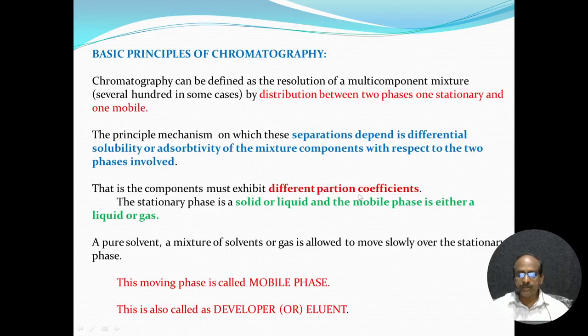That is the keyword to mention in the basic principle of chromatography: the different partition coefficients. The stationary phase may be solid or liquid, and the mobile phase is either liquid or gas. Please remember that the stationary phase may be liquid or solid, whatever it may be, and the mobile phase is either liquid or gas. That is the most important point for the two phases.